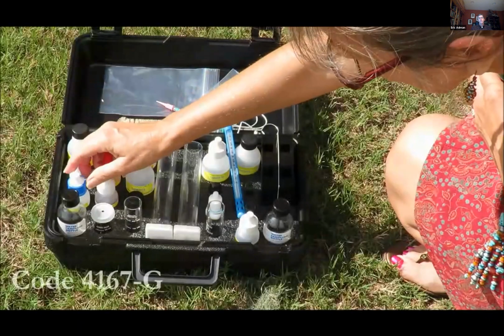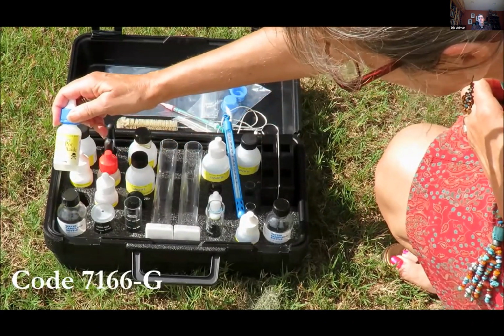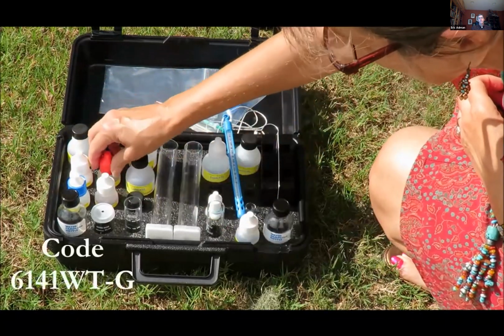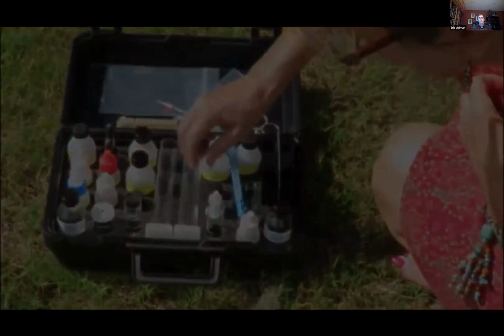For this step you will need manganese sulfate, alkaline potassium iodide azide, and 1:1 sulfuric acid. Each of the following steps should be done for both samples collected in step A, one after the other.